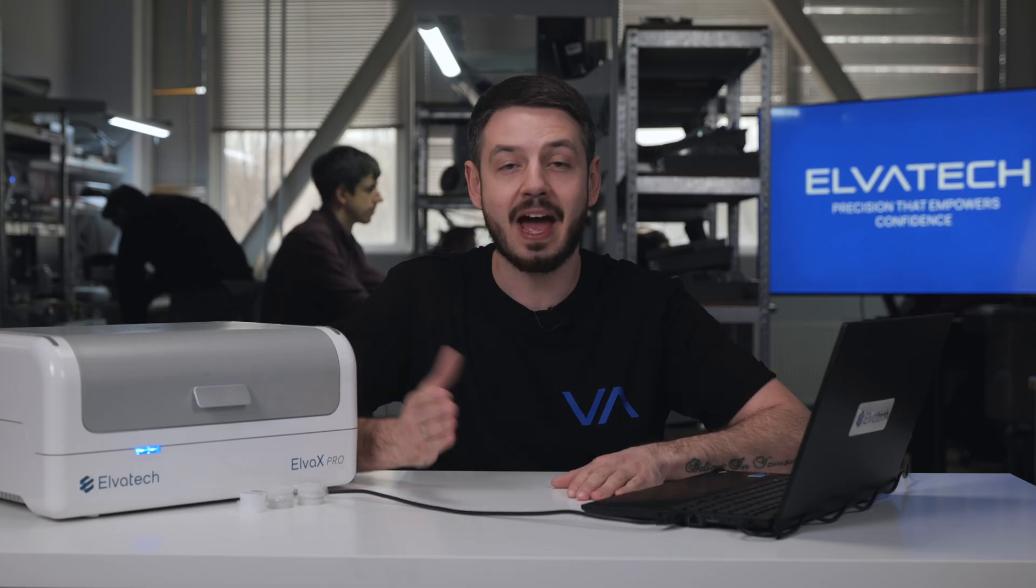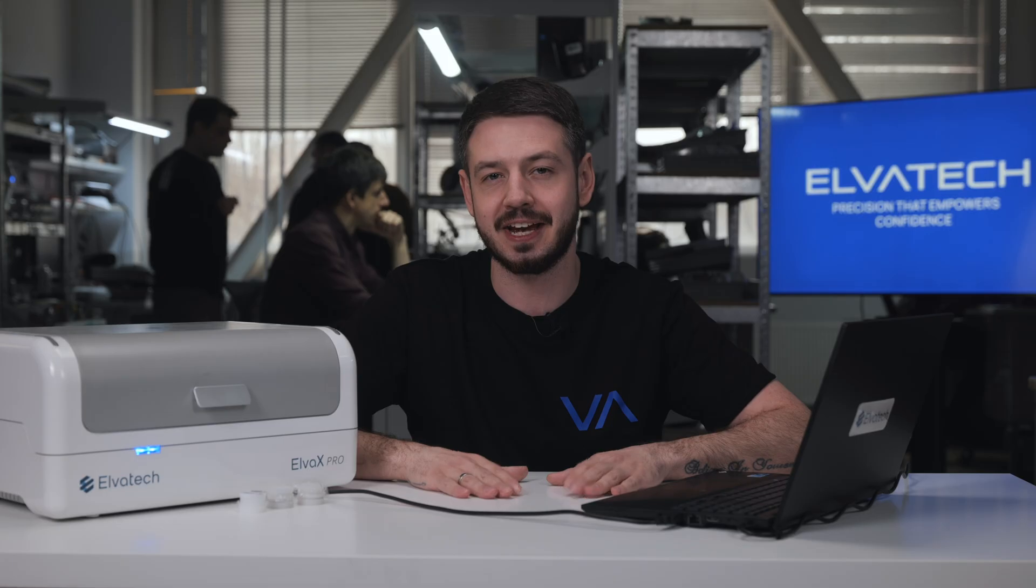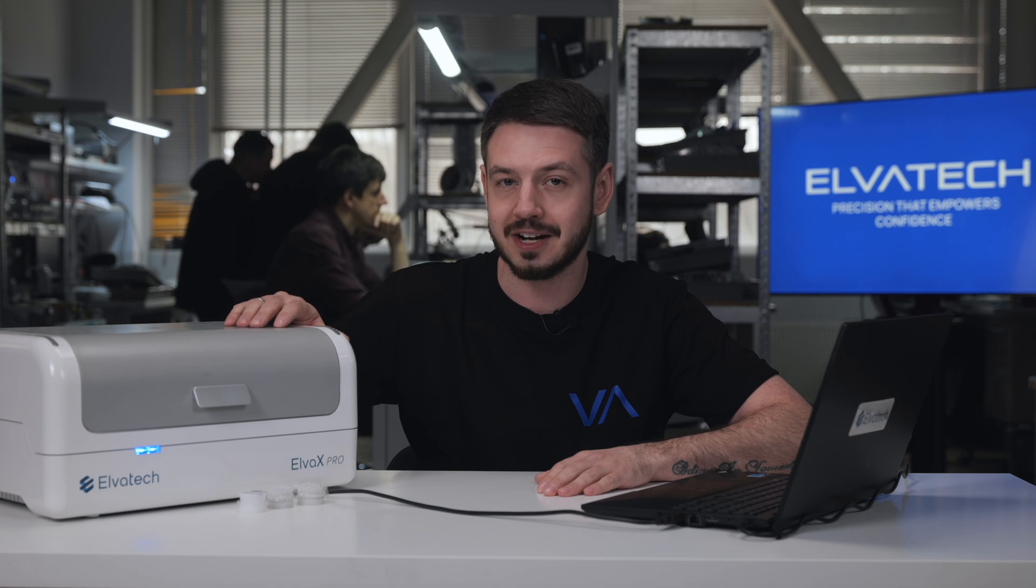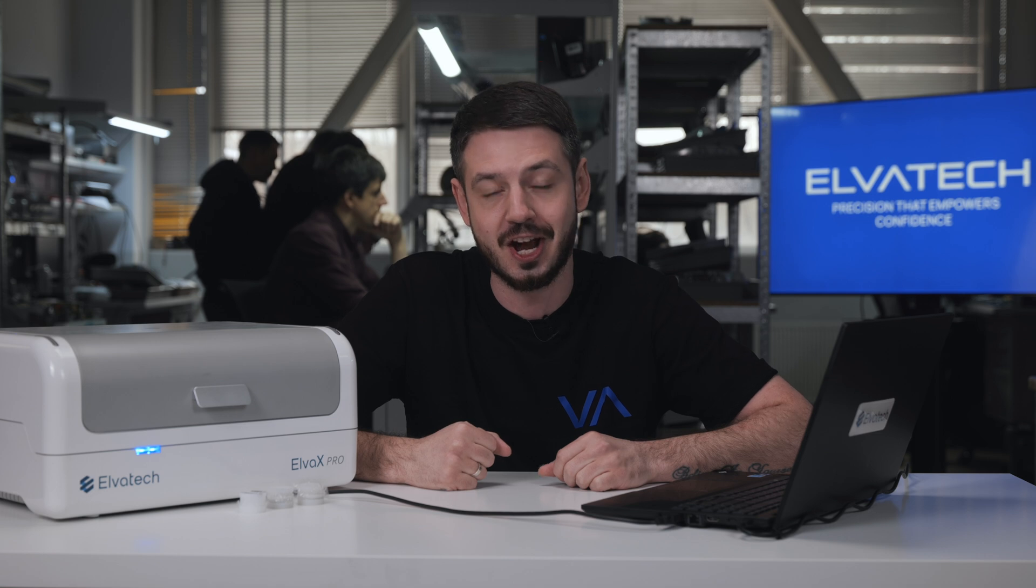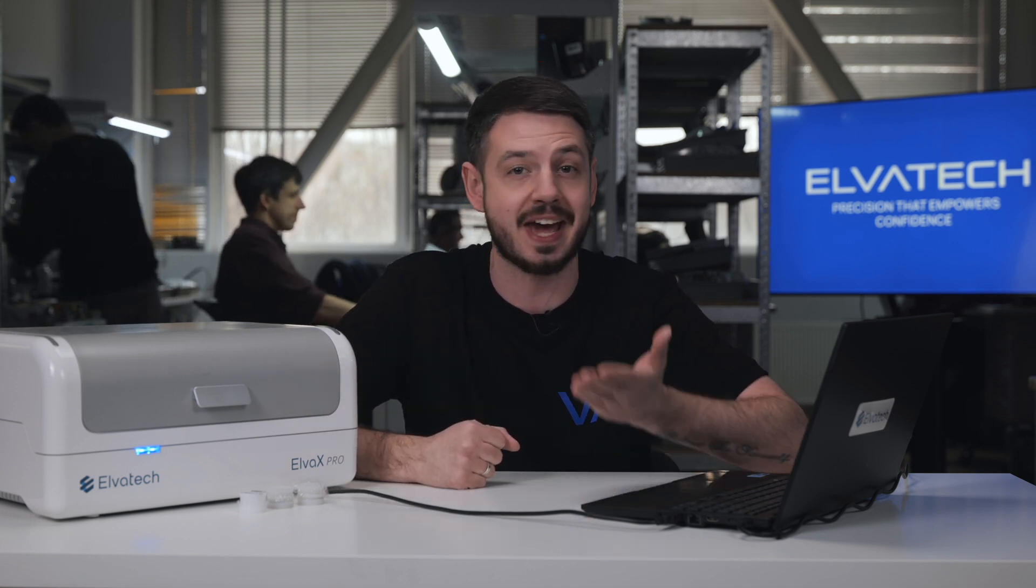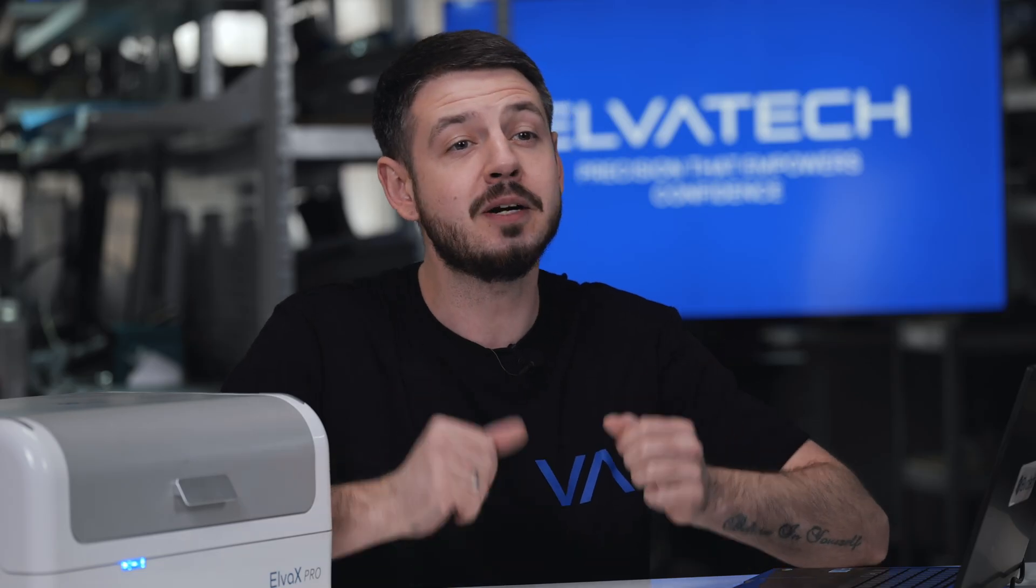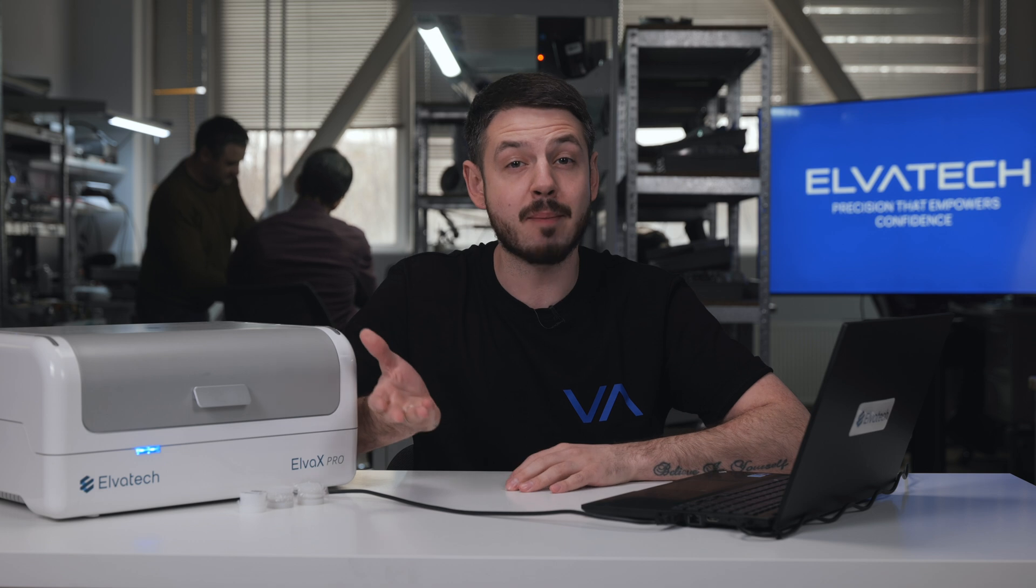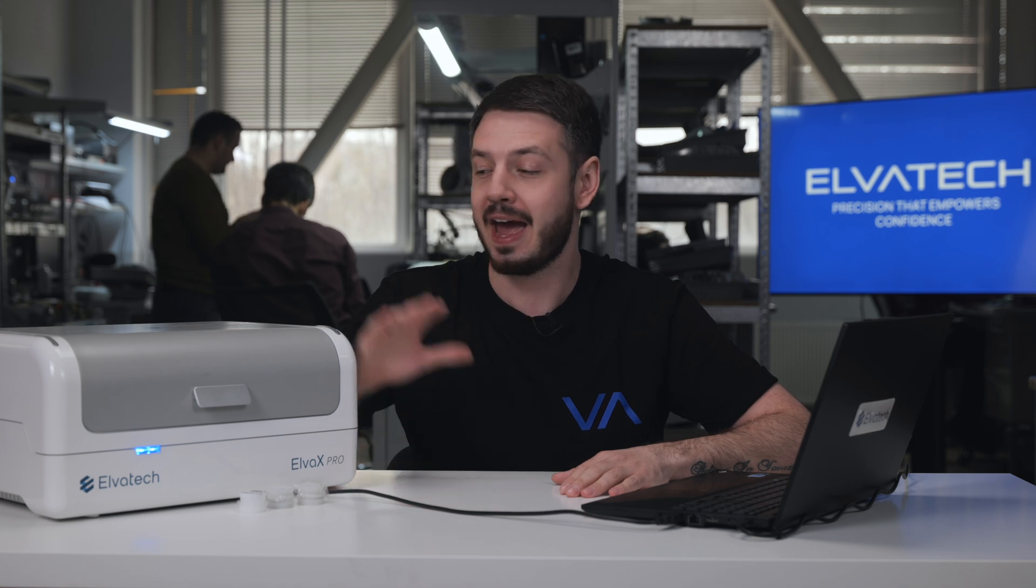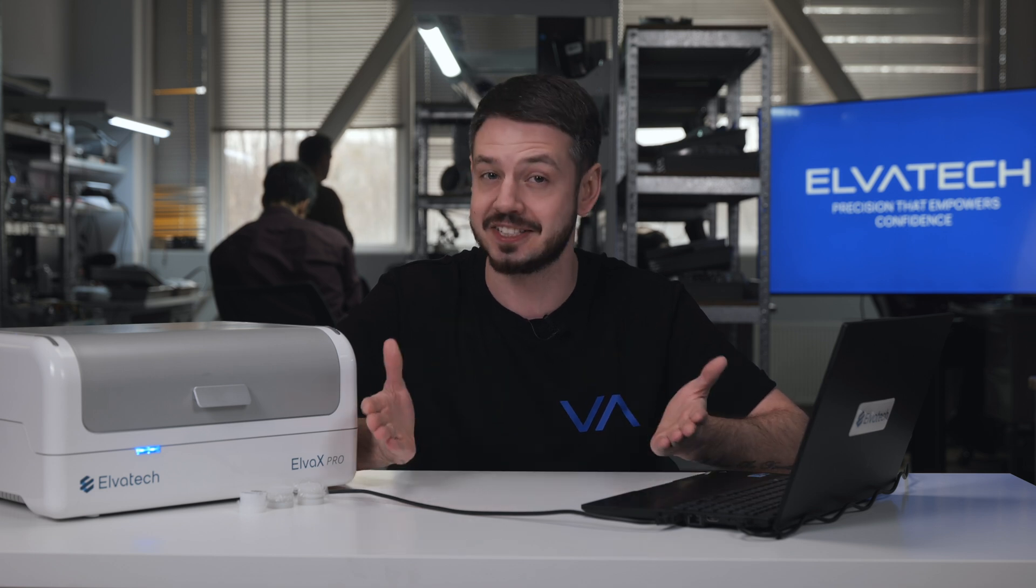As we have seen, Elvox Pro offers everything a modern cement lab needs: speed, precision, and reliability in one robust system. Whether you are checking clinker composition, verifying raw materials, or monitoring product quality, Elvox Pro delivers accurate results in just seconds, without sample destruction or time-consuming preparation. It supports international standards, such as ISO 29581-2 and ASTM C-114, making it fully compliant for cement quality control and certification. With automated sample handling, large detection area, helium purge, and powerful software, Elvox Pro helps your lab operate faster and more efficiently every single day.